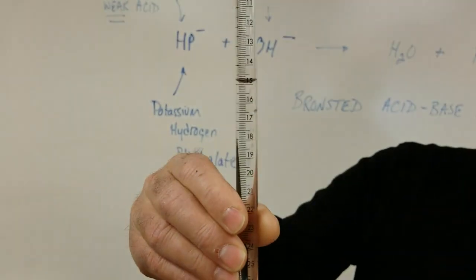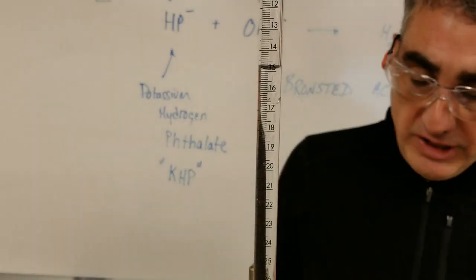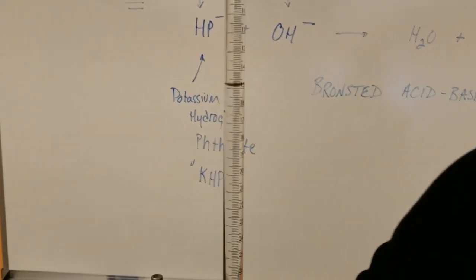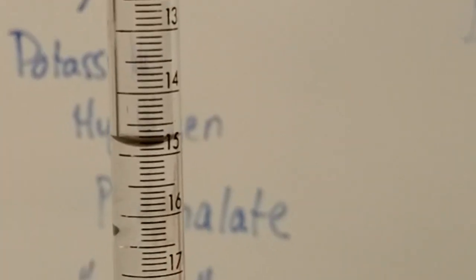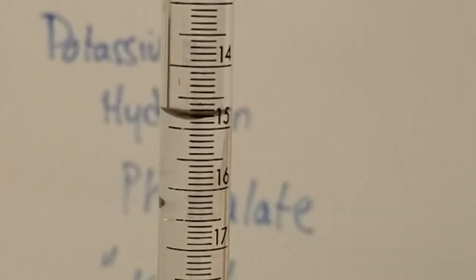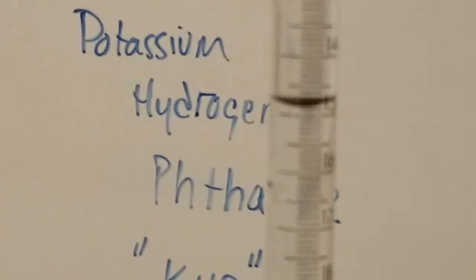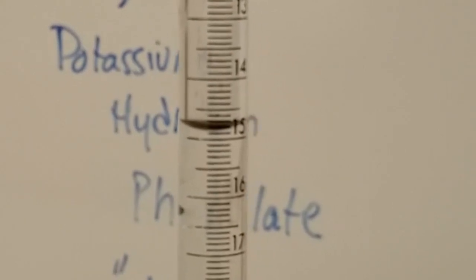Let me turn this around so you guys can see it. Okay, and if I were reading that, I'm just going to reposition this a little bit so I get a better look at it. And I need a little piece of white paper.